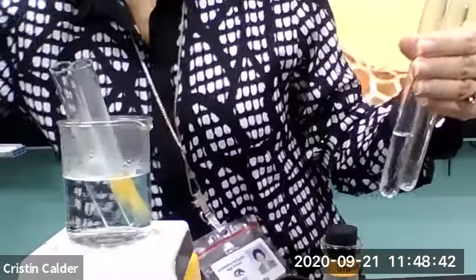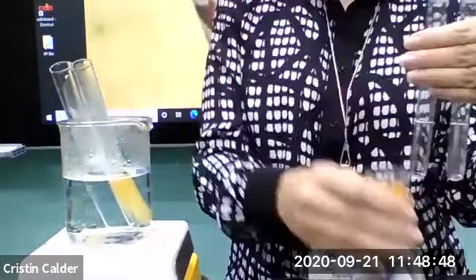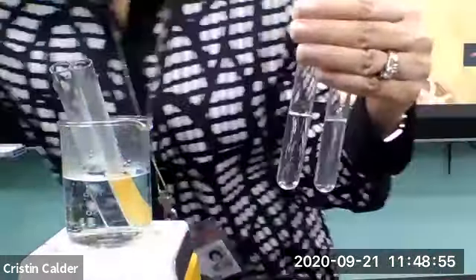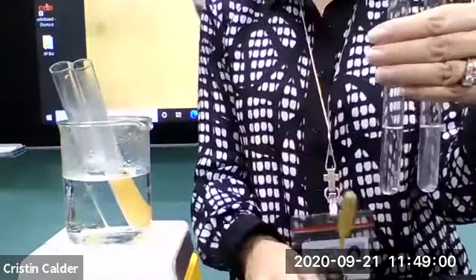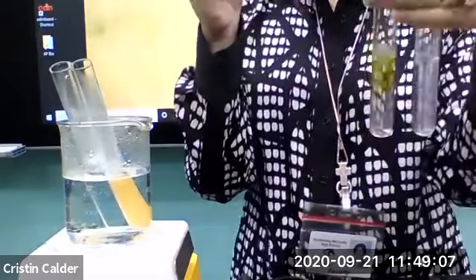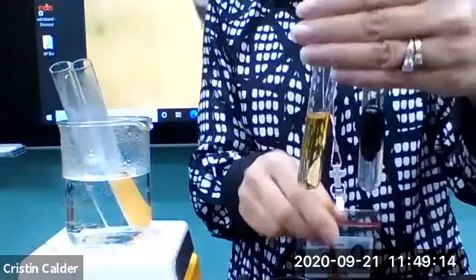Now this one does not require heat, so I'm just going to pour this starch solution into my other test tube here. All right. And then my test for this is actually Lugol's solution, which is this. It's an iodine solution. So I'm going to put a little bit of Lugol's in my water. This is a negative test, you can see. And then I'm going to put some Lugol's into my starch solution, and this is a positive test.